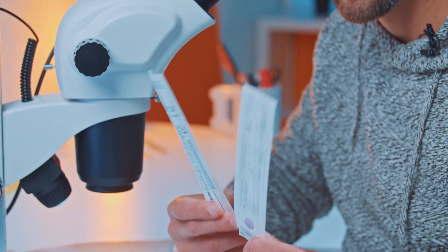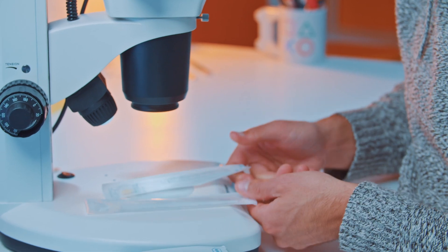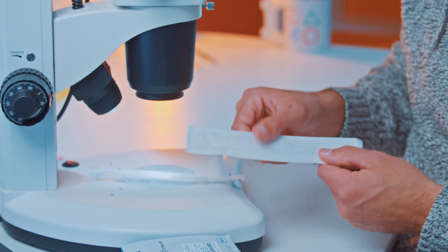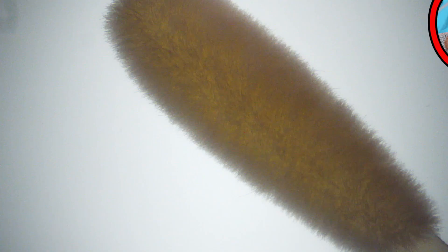Let's have a look at the microscope how it really looks like. So we've got two different brands of the swab here. They're also very different. The one is a bit more flexible here on the front, the other one is very stiff, has a much more stiff rod. So this one's quite interesting. So let's open this one first and see how the swab looks like up close.